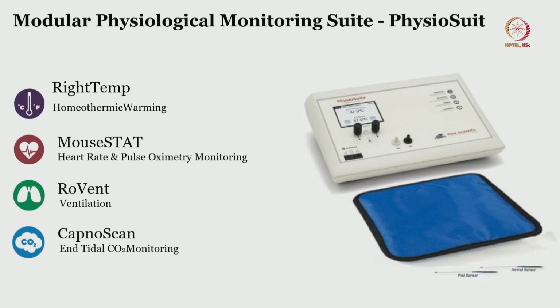This is one example by the Kent group, where a modular physiological monitoring suite is available with the PhysioSuite setup, where they have homeothermic warming with the right temperature peripheral, and there is the MouseSTAT modular system wherein heart rate and pulse oximetry are measured. All right, I am sure post COVID all of you are familiar with this pulse oximetry, which can be applied onto the paw, wherein it shows SpO2. All right, SpO2 is oxygen saturation, which needs to be at least more than 95%.